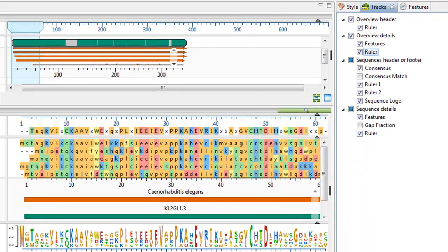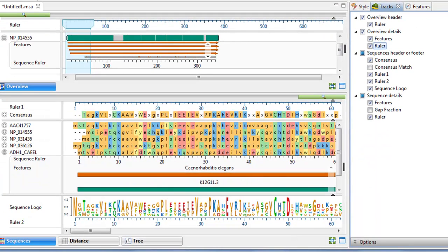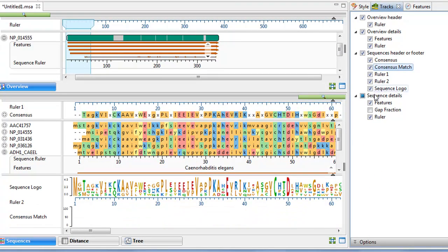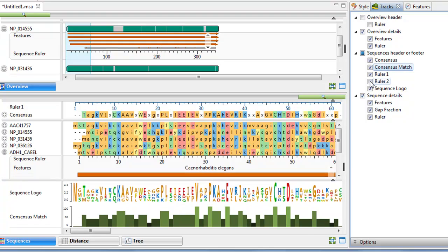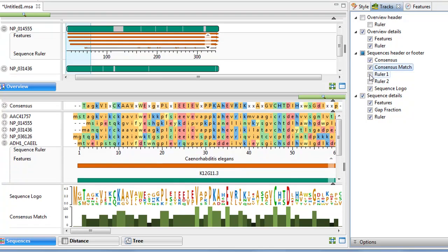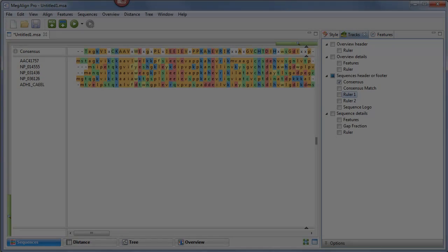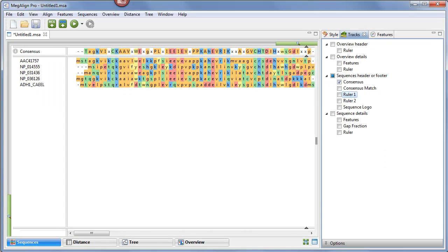Put check marks next to tracks that you wish to display and remove check marks next to tracks that you wish to hide. Tracks are added to the Views in the same order in which their boxes are checked in the Tracks panel.